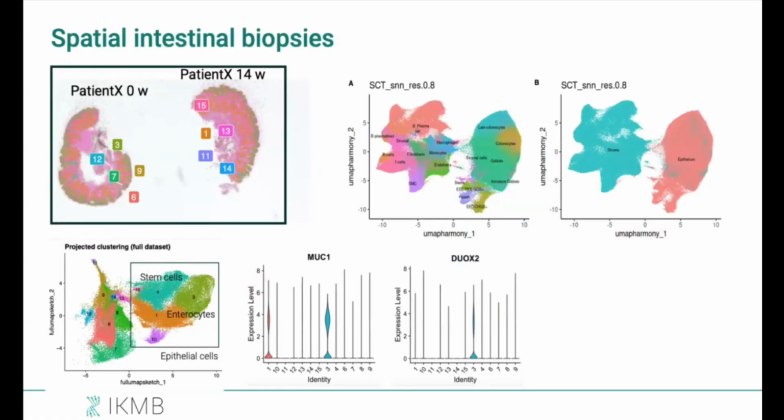This is Visium HD samples. They are very similar. Of course, they were preserved differently, but they were taken at the same time for the patients that you just saw in the single cell. And this is what we are doing now. We are actually able to put multiple biopsy cuts in one Visium HD because they are so small. We can do multiples. It's much better for us because we are not losing the whole information just because our biopsies are very small. So now we can project what we learn.